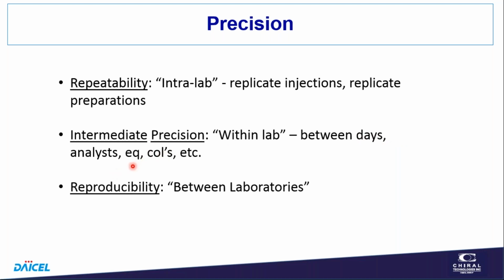What about the equipment? Does it matter whether you use a UHPLC or an instrument that maybe came from a previous century and has a little extra column band broadening? Does it matter, or maybe a longer delay time? Is there a lot-to-lot variability, and so on? And then certainly the collaborative study between laboratories. So these are things that we worry about in achiral chromatography. We also can worry about them in chiral chromatography.